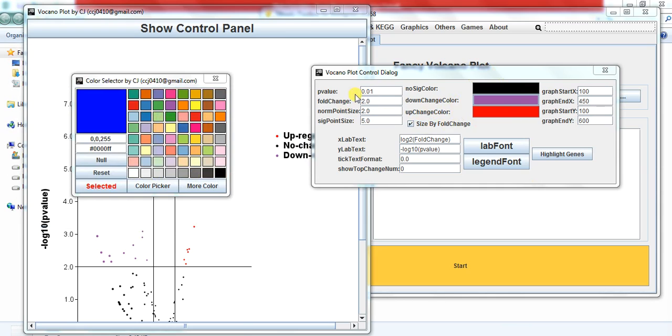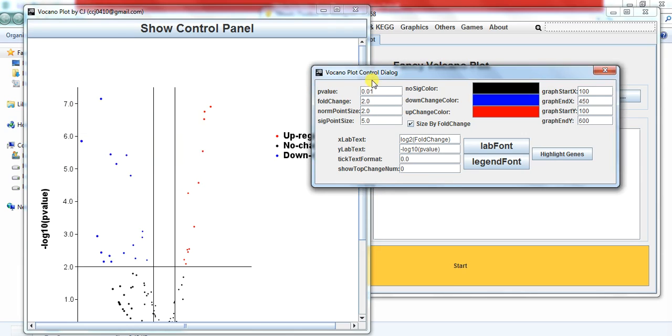Here you can change the p-value up to 0.01 to 0.05 and see how many genes had the upregulation or downregulation.